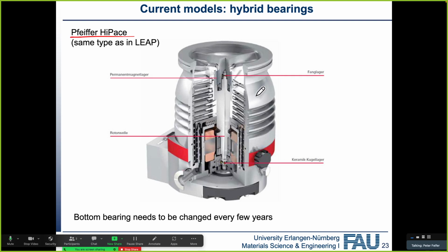And typically, an 80 liter per second turbo pump, which is a turbo pump that fits on a CF63 flange. You will always find some very distinct sizes with the pumps, because they're typically matched to the flange sizes. In this case, we haven't talked about KF flanges, so this is an ISO K63 flange.